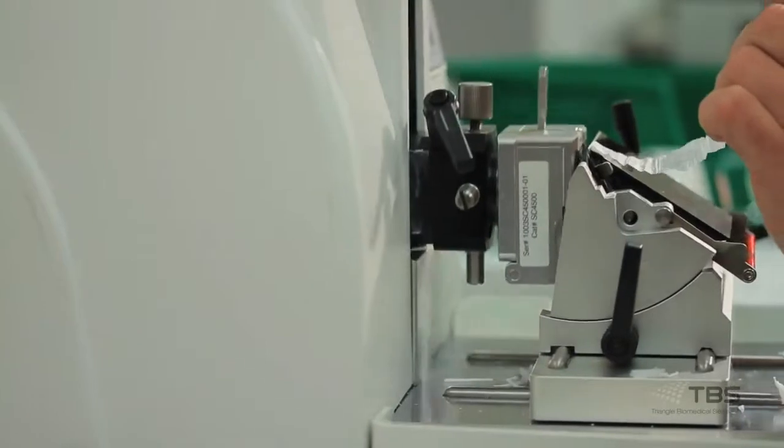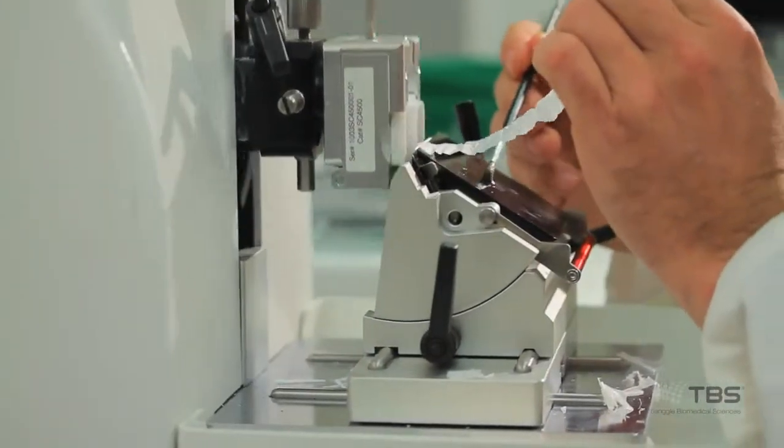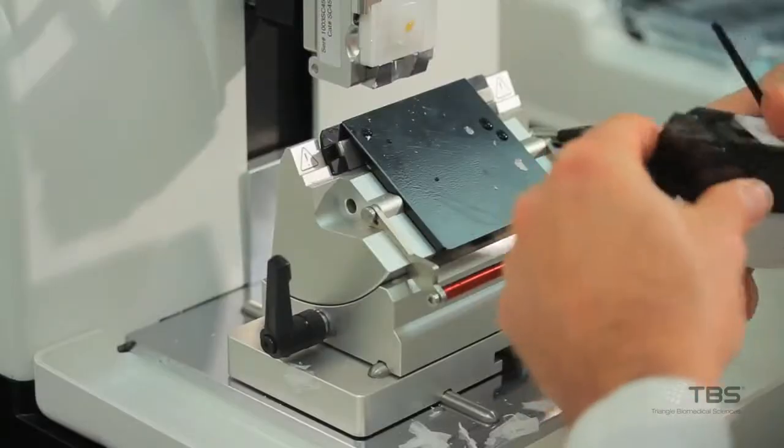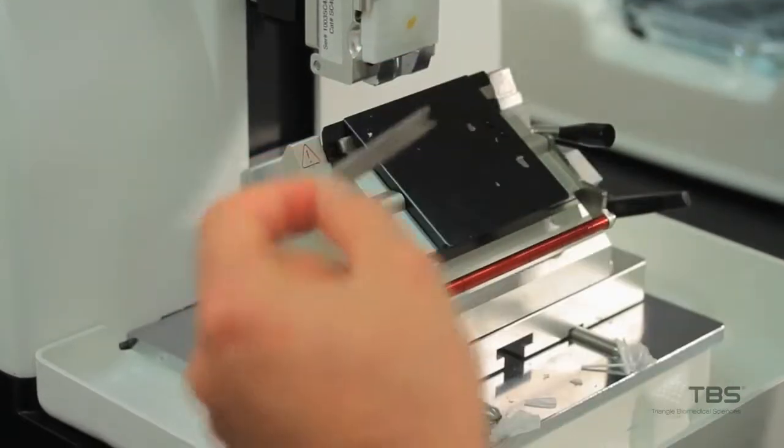All TBS Microtomes come with a motorized specimen arm and a universal blade holder that accepts both high and low profile blades.